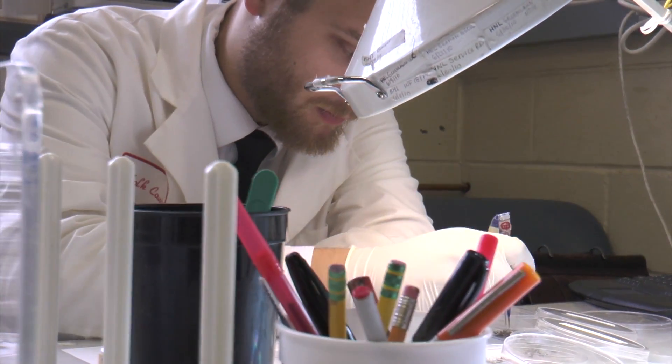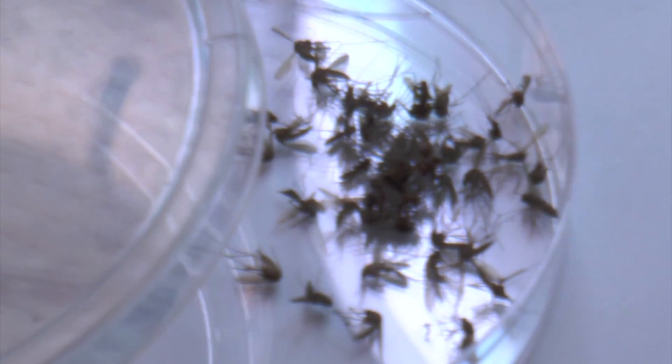Are you separating male, female, and breed? Yes. The females we sort out overall because females bite — males don't. Females need the blood and the proteins to have their eggs and such, so it's the females that do all the work.